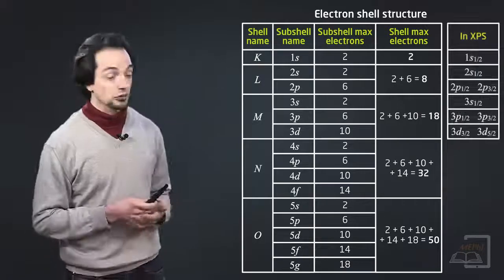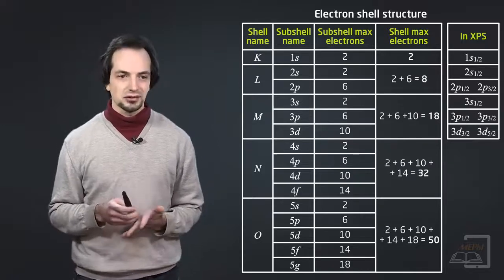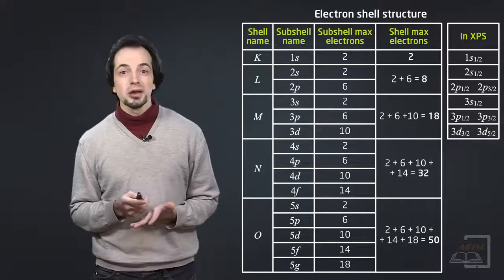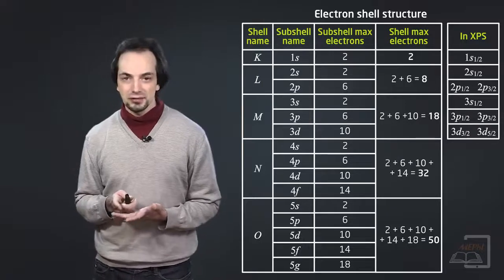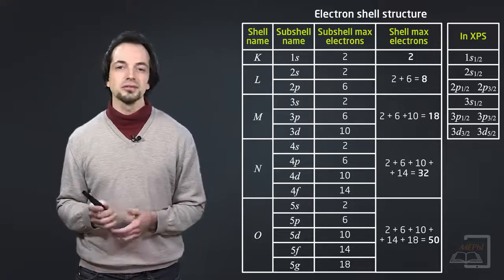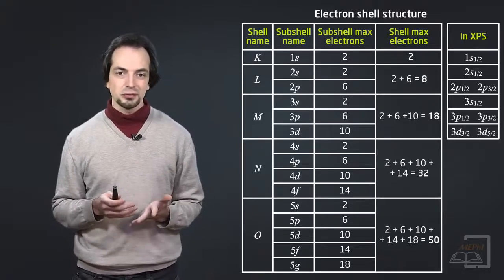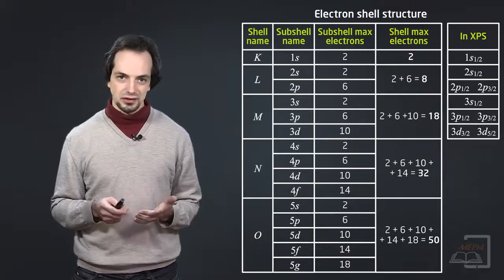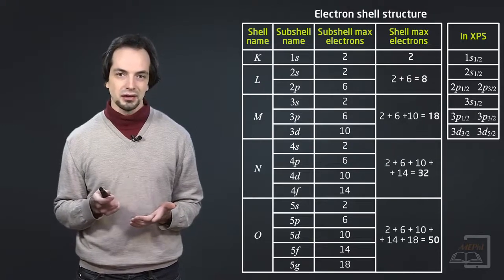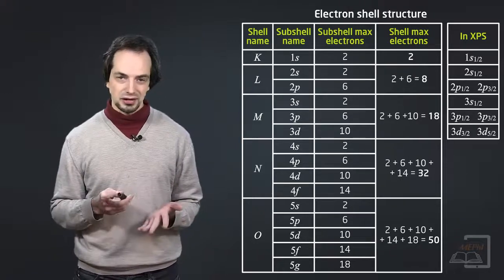For example, as shown in this table, the electrons are labeled like 1s, 2s, 2p, and so on. We know these energies for any kind of atom. They could be calculated. So all binding energies for all atoms are already known. So that's why we could say, by measuring the photoelectron energy, whether it is this atom or that or another.